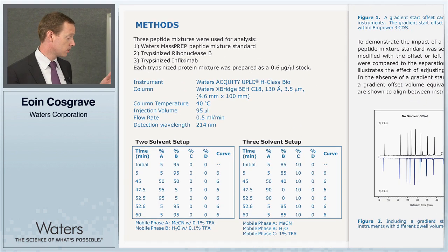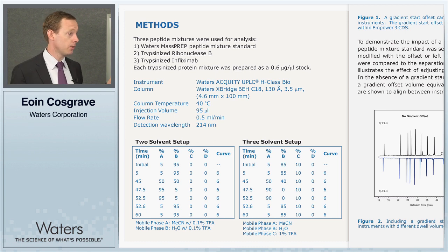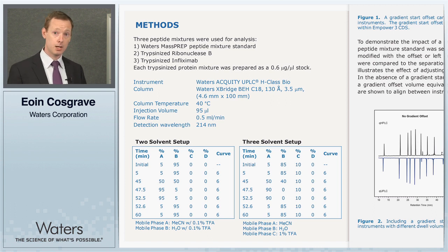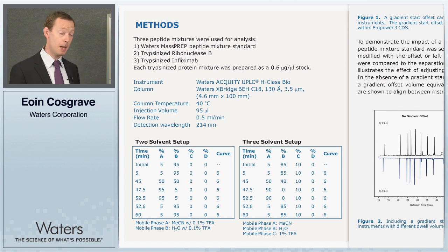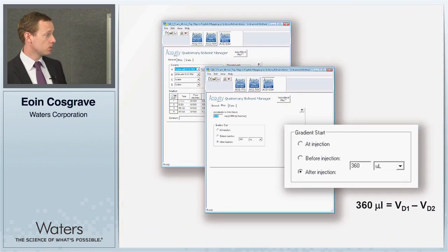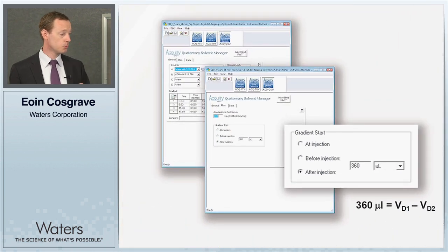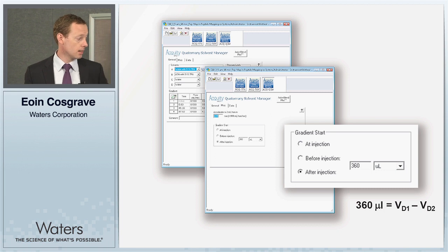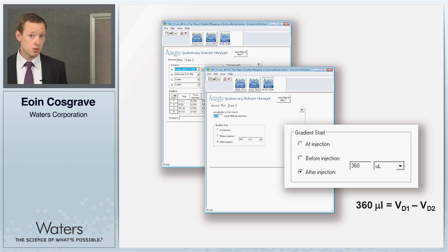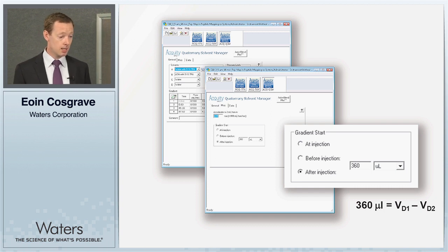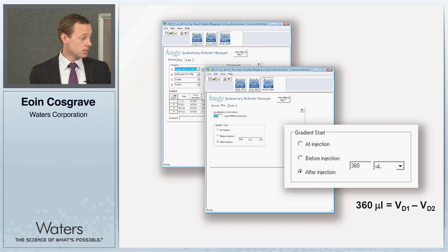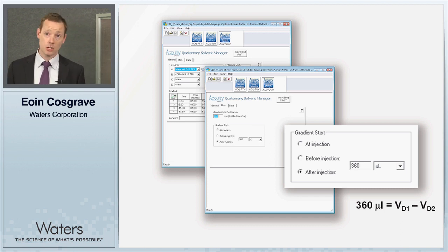In this example we've used the H-class Bio with HPLC columns. One thing we focus on specifically is determining the dwell volume differences between an HPLC instrument versus the UPLC, because we find that has a very important impact on the chromatography. In figure one, we address the difference in dwell volume between the two instruments, which is easily adjusted in the instrument method by selecting an after-injection delay volume. By doing so, you can align the chromatography and include this isocratic hold step within the instrument method without making any other changes to the gradient setup.